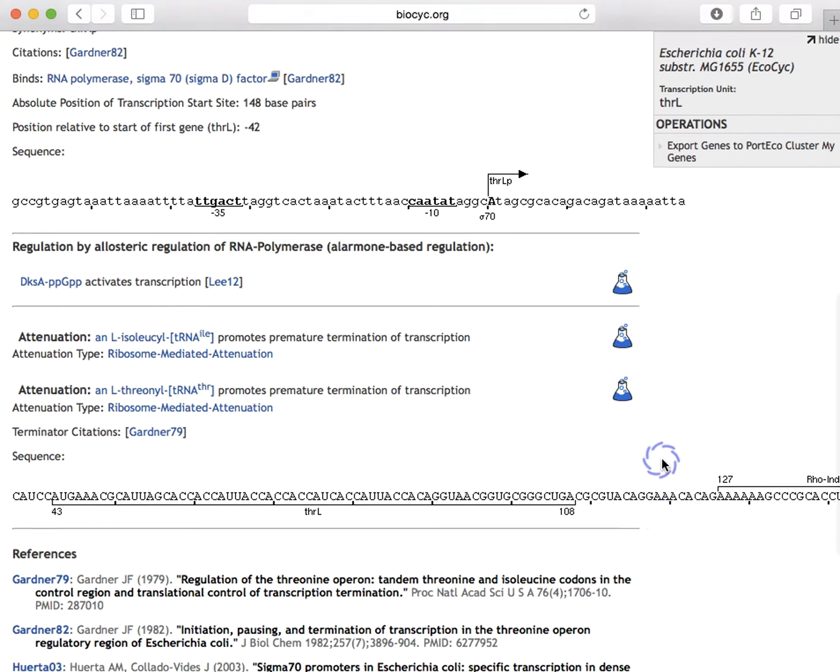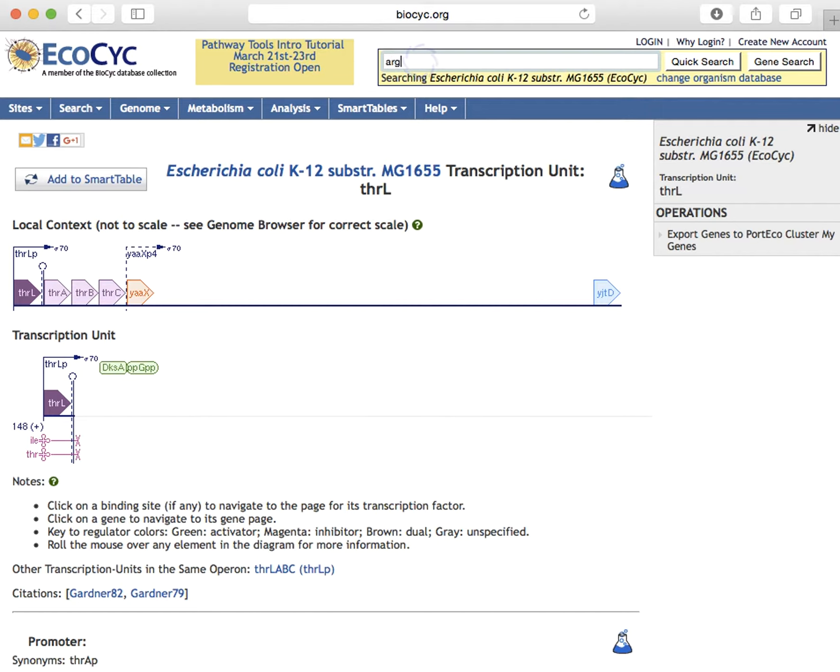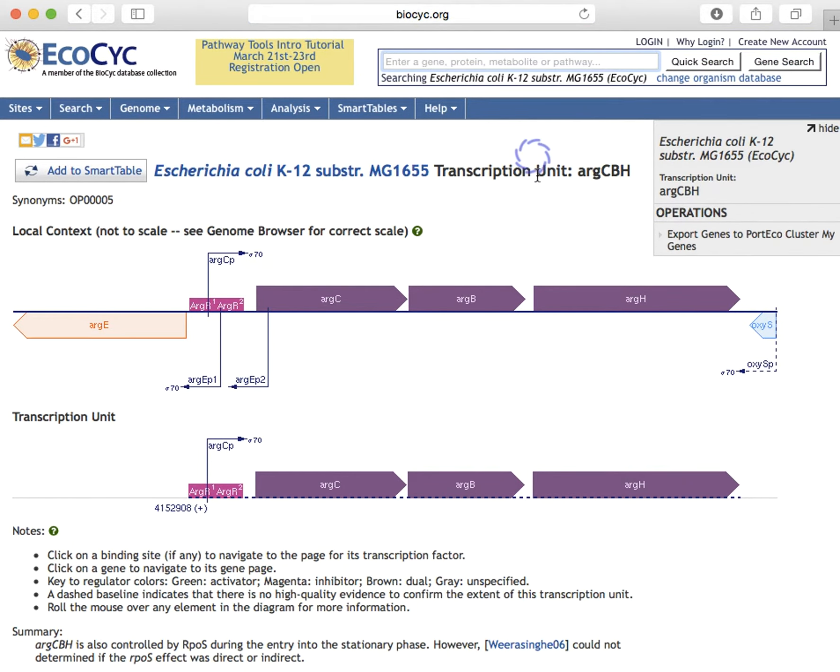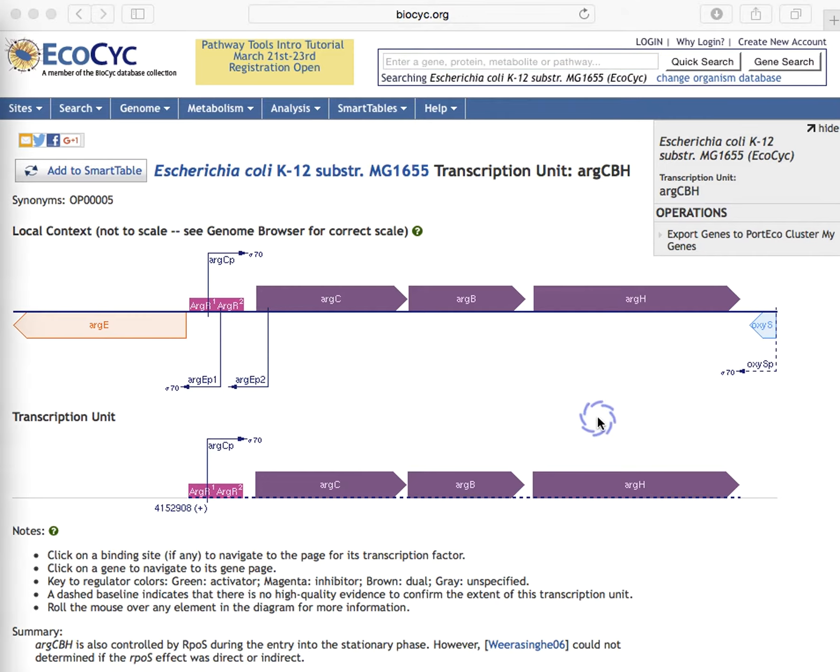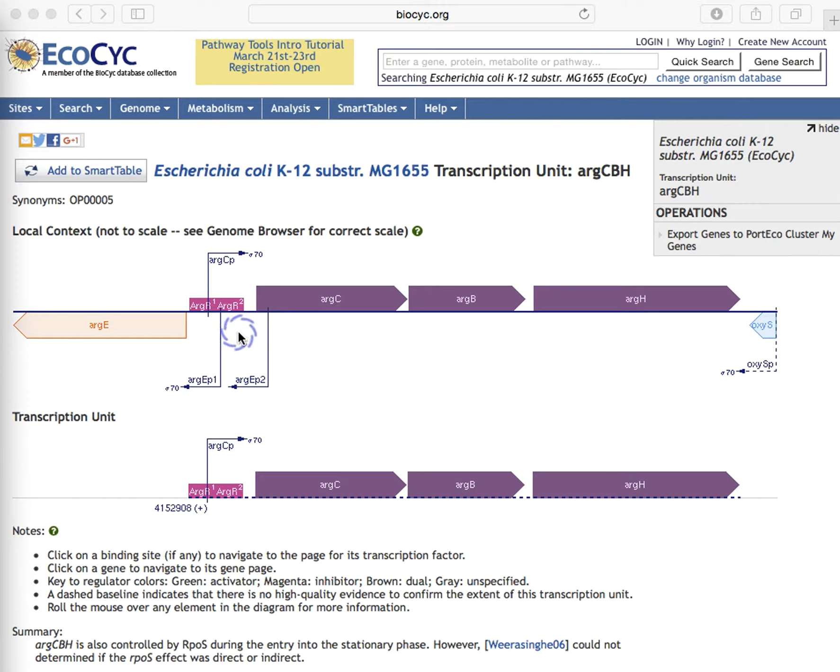We're now going to visit a different transcription unit, and it goes right to that result because there's only one result matching that name. Here we'll show you what is shown when transcription factors are present. Here each transcription factor binding site is numbered in case there's more than one site for the same protein, which is the case here, and these sites are colored red to indicate that they repress transcription.